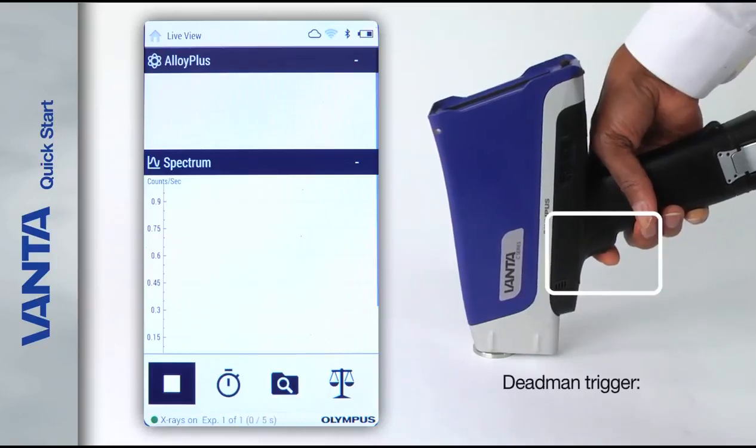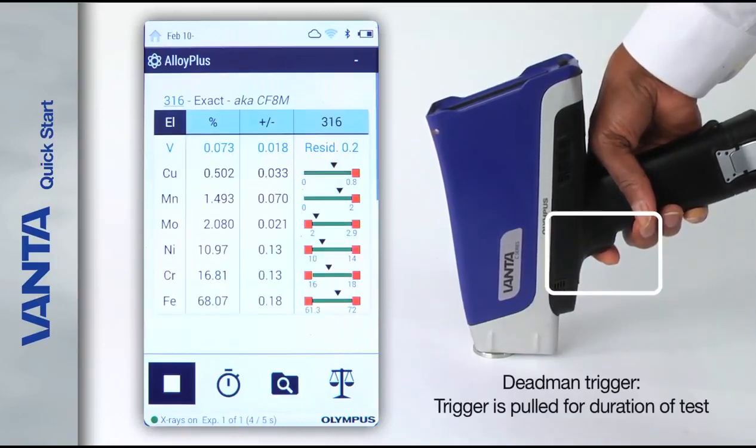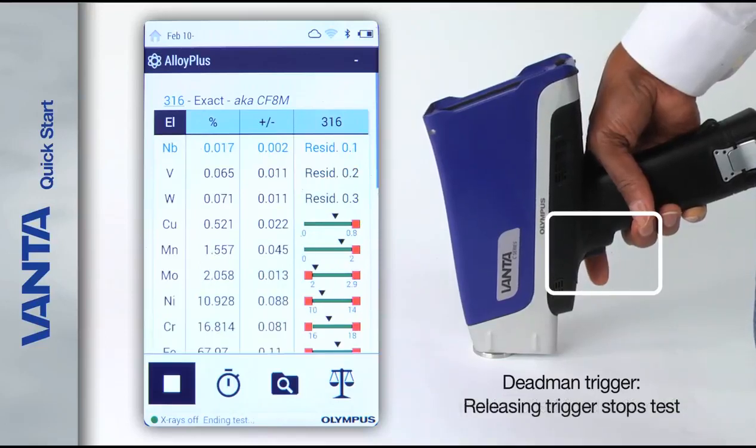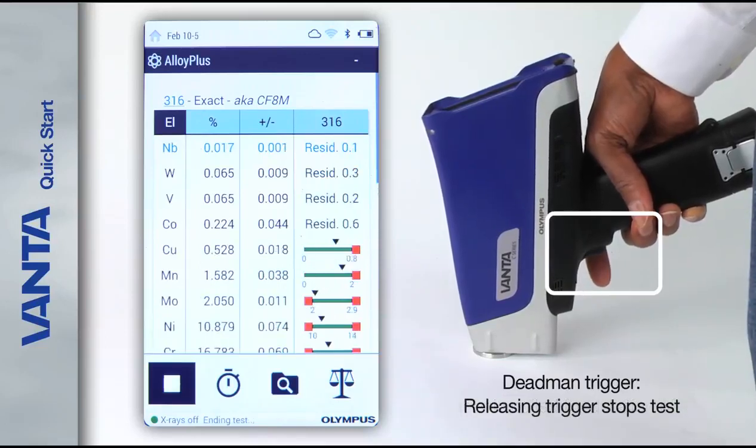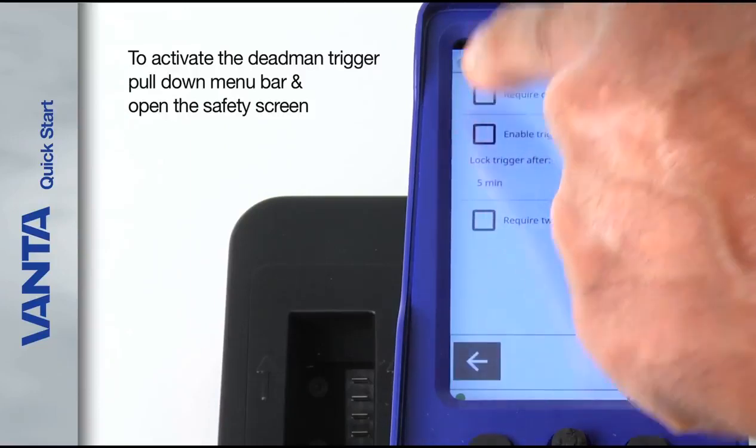Some users utilize the dead man trigger, where the trigger must be pulled for the entire duration of the test. Releasing the trigger stops the test. To activate the dead man trigger, pull down the menu bar and open the safety screen.